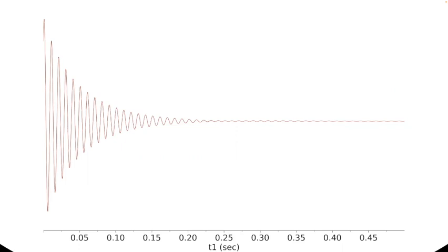So under this condition, that nucleus is spinning around inside the coil, exactly the same as we saw for the gyroscope in the little video just now. This also decays over time. We'll talk more about that in subsequent lectures, and that decay will be useful in many cases.